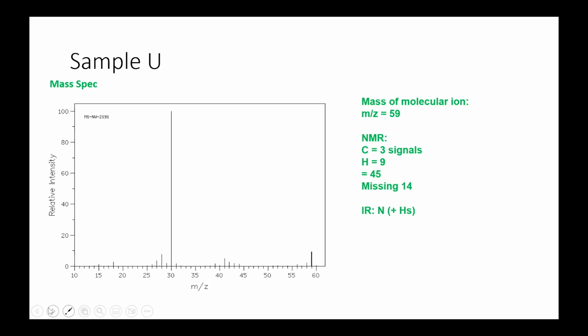So if we think back to our IR spectrum, that signal that was just below 1680 obviously wasn't a carbonyl peak, so we can rule that out. So we're looking like we potentially just have an amine in our compound. And again, just to confirm, it's not halogen. We don't have that 1-to-1 or 3-to-1 molecular ion peak we would expect to see if we had, say, a bromine or a chlorine in our molecule.